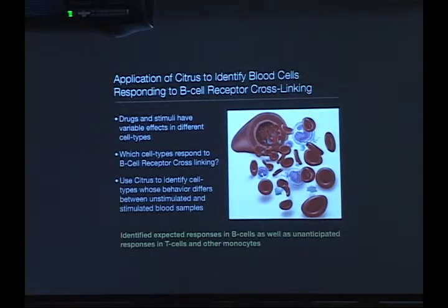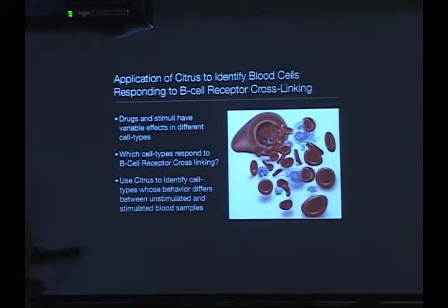So very quickly, let me show you what this looks like in practice in a real data set. Eli showed you one slide from his barcoding work earlier. They took a bunch of patients' blood and measured PBMCs under different experimental stimulation conditions. And one of those experiments that he performed was looking at responses to things like a BCR crosslinker.